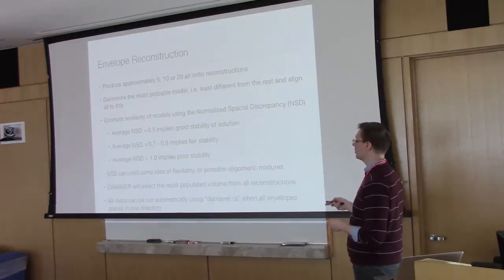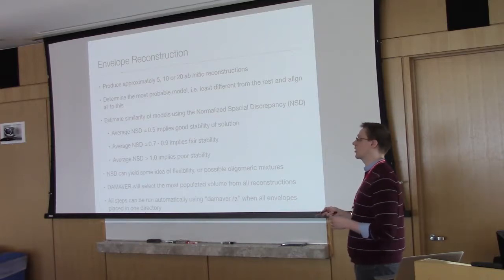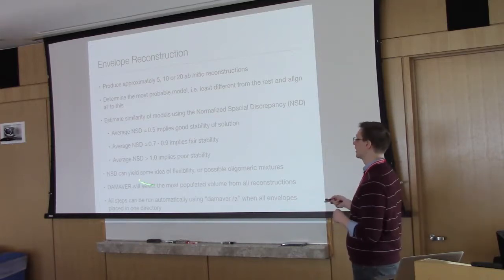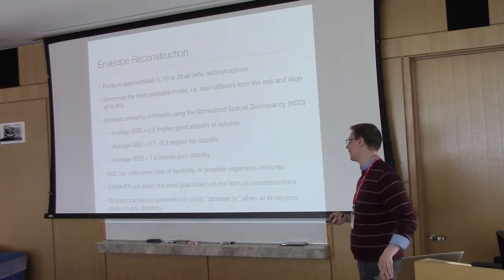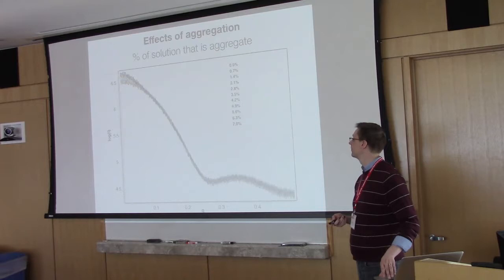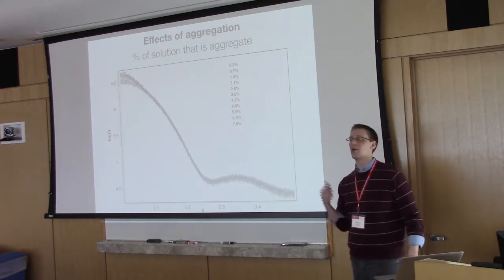And so in addition to DAMAVER, you can use the program DAMCLUST, which will try to cluster these things together, and I think that's maybe one of the tutorials that will be going over tomorrow. Okay, so now I want to talk about aggregation. Yes?